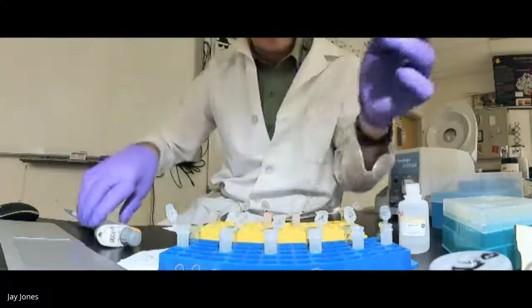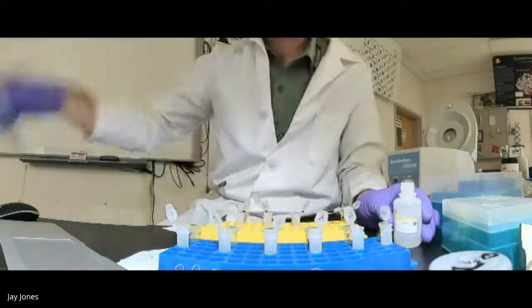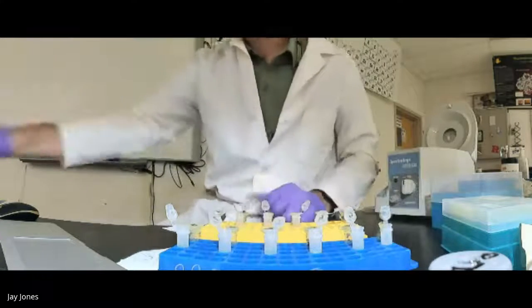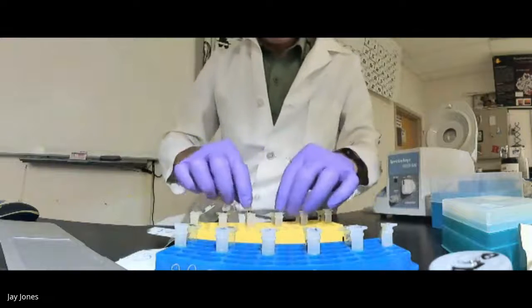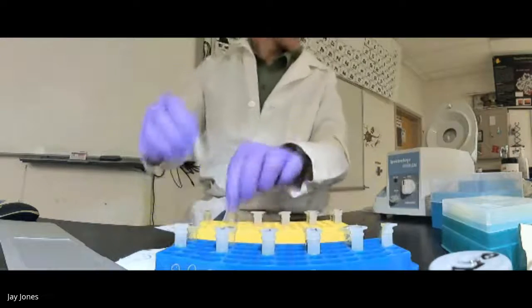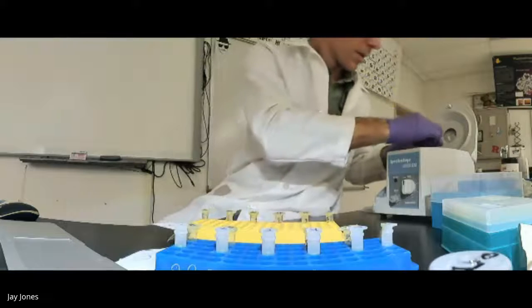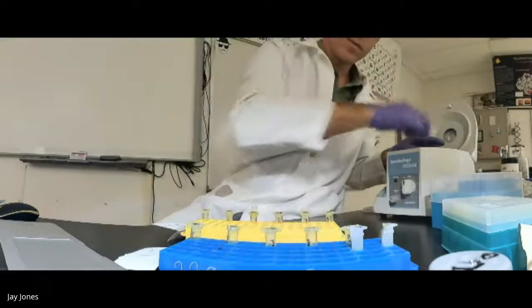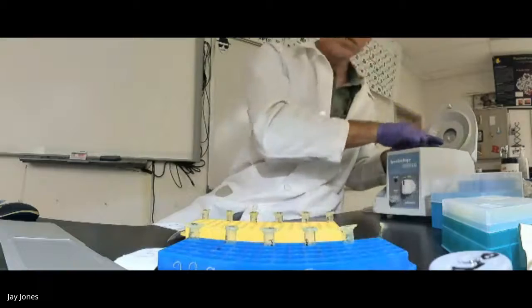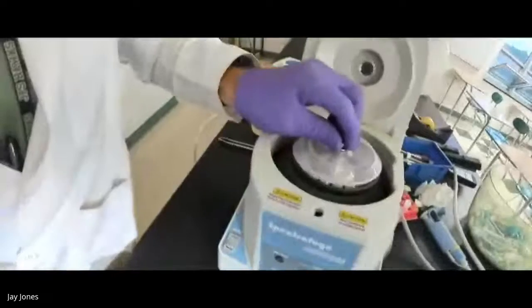No. See that table two, I think I spilled it. I'm gonna go back and give you guys more. Doesn't matter really. All right, give you guys more just in case, because I thought I spilled it. So cap these up. And let's put these in the centrifuge. Balance the centrifuge, hinges are out. That one's now out. And let's spin these. Let's spin this wash buffer through for 1 minute.